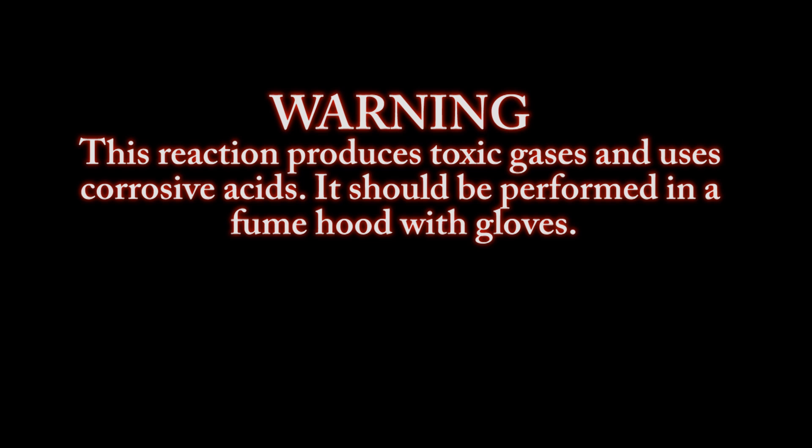Warning, this reaction produces toxic gases and uses corrosive acids. It should be performed in a fume hood with gloves.